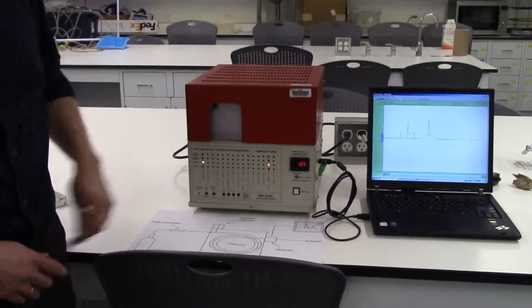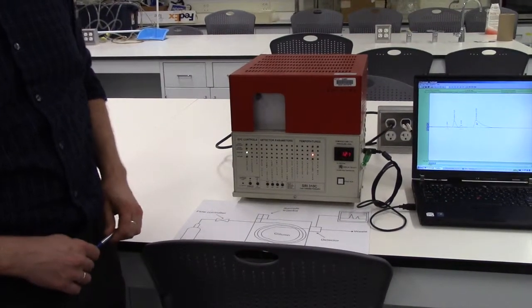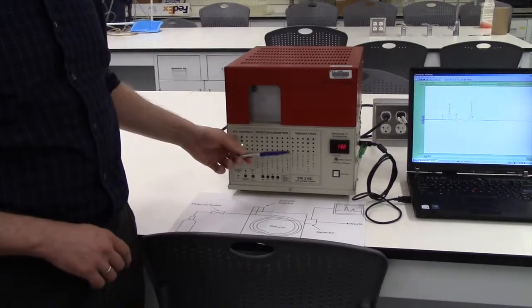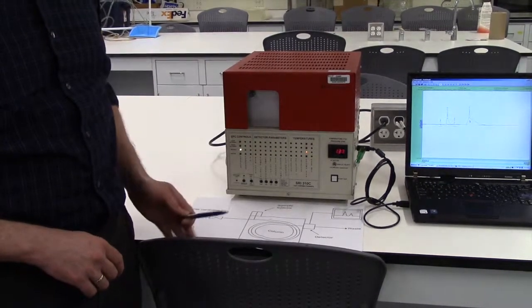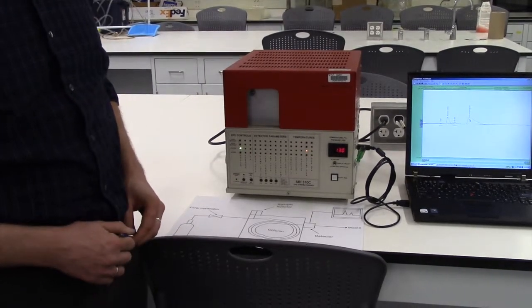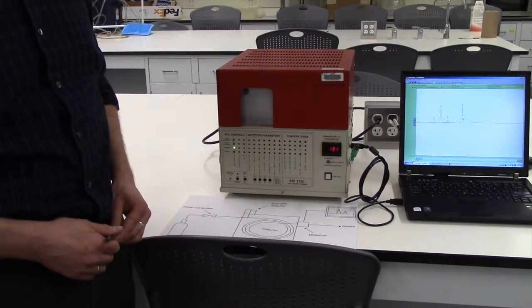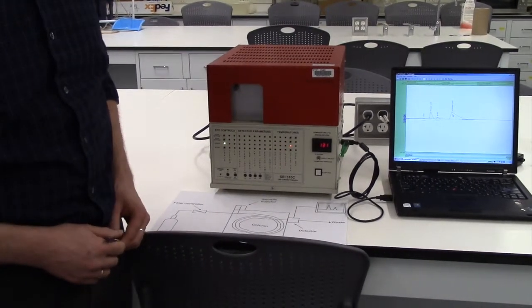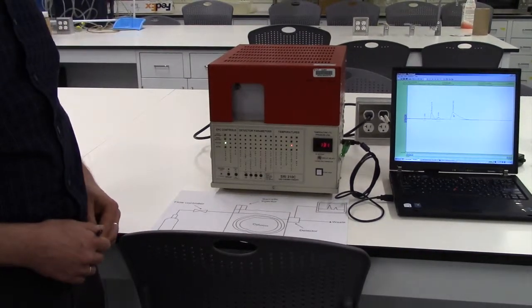Yes, you'll see it. It will get back to the predefined starting point of 130 degrees centigrade. So once we get the temperature equilibrium, which is 130 in our case, as was predefined in the settings, and after some period of stabilization, you'll see the green light on the start button, which will indicate that we can proceed with our testing or sampling investigation of our mixture.